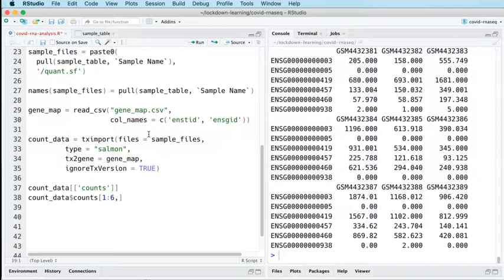So tomorrow we're going to get this data into DSeq, and we'll have a look at how normalization works. We'll take a look at the PCA plot that DSeq produces as well, because that's relatively straightforward to do. We'll start to think about the way that DSeq works and the maths that DSeq applies to this count data.